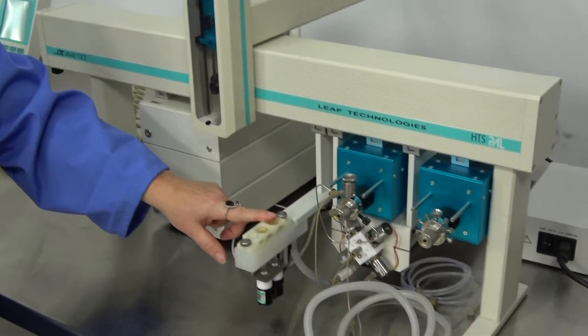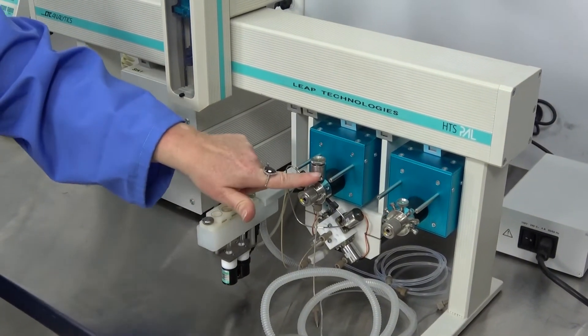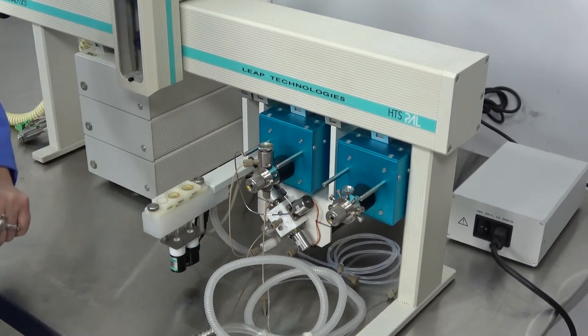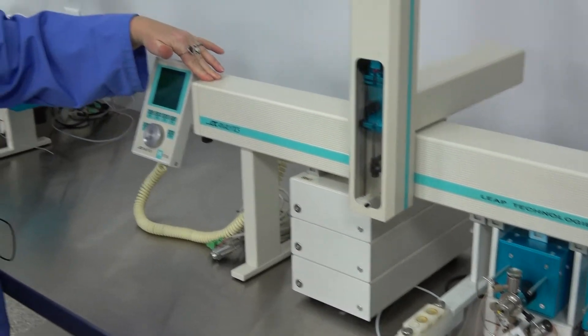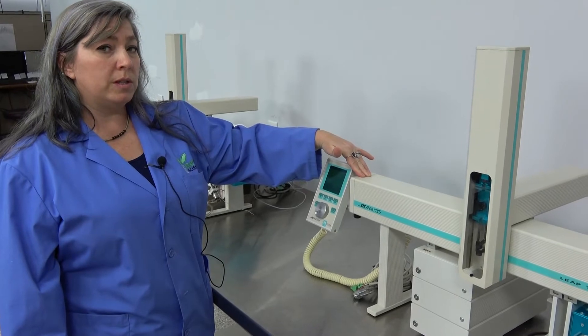This is the washing station for the syringe to stop at. These are the input inlets for your chromatographs. This particular system can run with software that is provided by the manufacturer of your specific chromatograph.